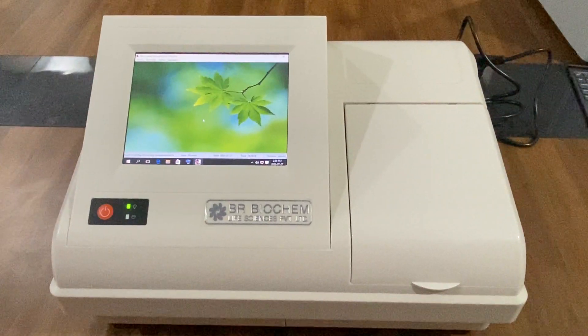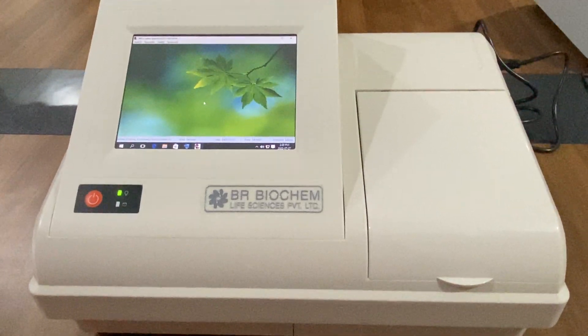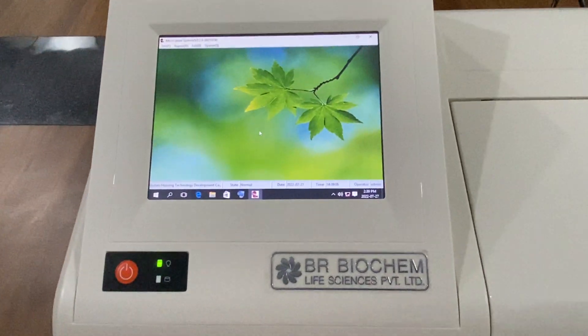Hello everyone, welcome to BR Biochem Life Sciences Private Limited. Today we are discussing about the ELISA reader. As you seen in this video, this is our ELISA reader.